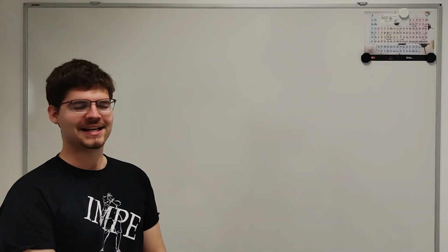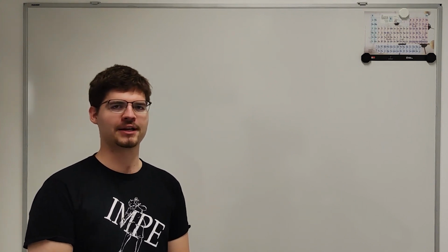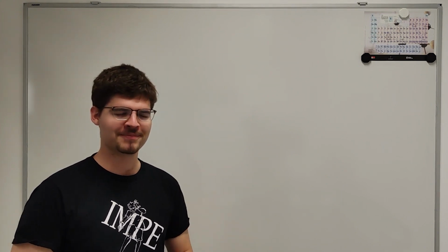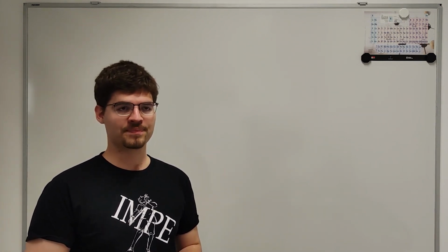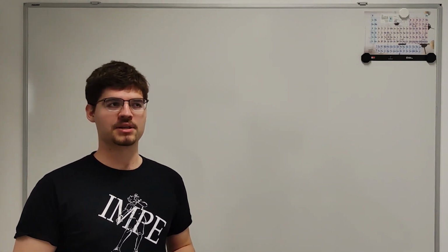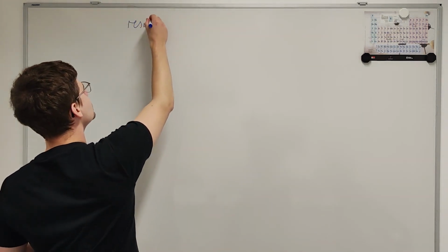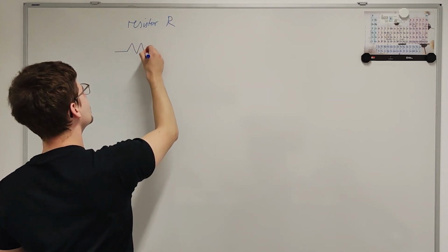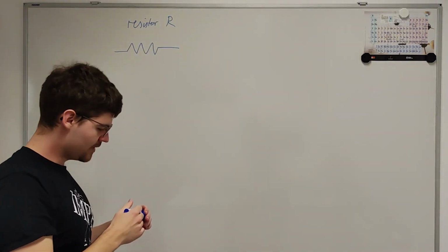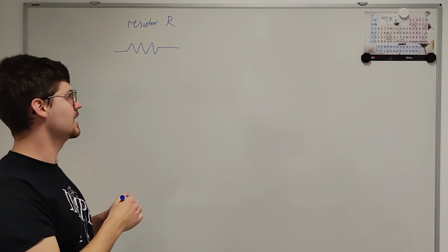Alright, let's get into the electrotechnical circuit elements behind the interpretation of electrochemical impedance spectroscopy. The most fundamental element that we're dealing with is the resistor, commonly symbolized by the capital letter R. This is the commonly used circuit symbol for this element.